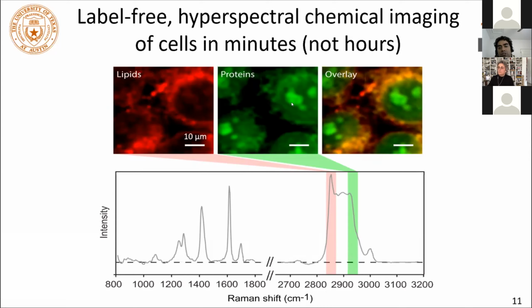That's a difficult question because you can't label every protein in the cell. It's almost impossible to do that. Now you can see every protein in the cell. If you're interested in that question, you can see every lipid as well. So this is where you can make something that was invisible visible, but what I'll show later is you can also make something that was visible invisible by doing this in too complex an environment.